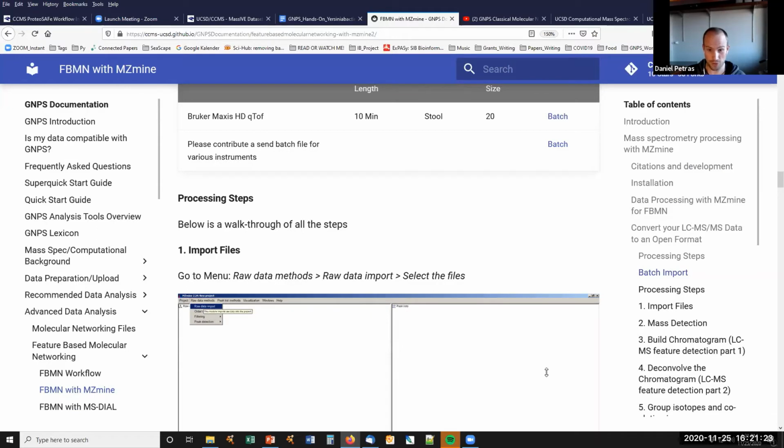I hope that what I've shown you today is enough information to at least start looking at your tandem mass spectra in a new way and more systematically make use of that amount of information. Because obviously, going manually through thousands of spectra is far beyond accessible anymore. So you need some type of software-aided tools to completely mine this data. And to me, molecular networking and GNPS are definitely a nice way, and I think a game changer to many people in natural product fields.